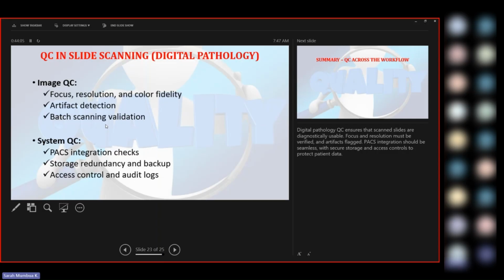Then from there, you do archiving. These blocks are permanent blocks. The slides are permanent slides. You can keep them up to 10 years. And remember what I said, a patient will come after 2 years: I want my tissue back. Will you still be keeping their mastectomy sample, will you still be keeping their gross tissue? No. So the block is what you have for them.